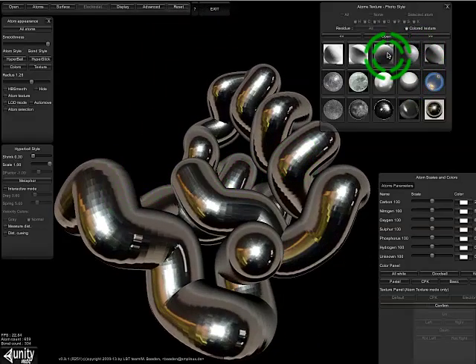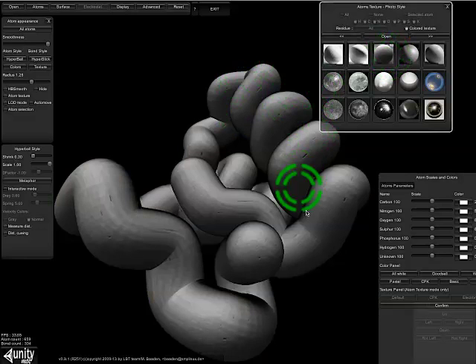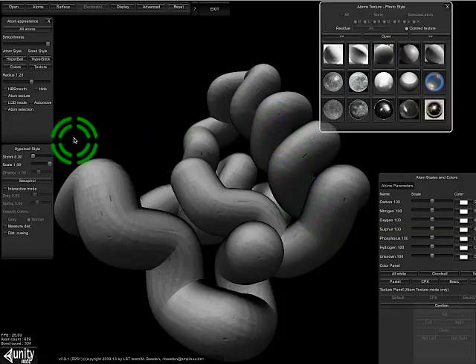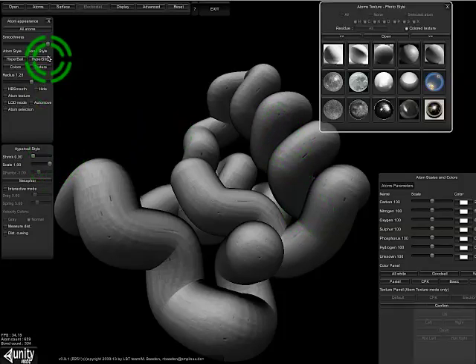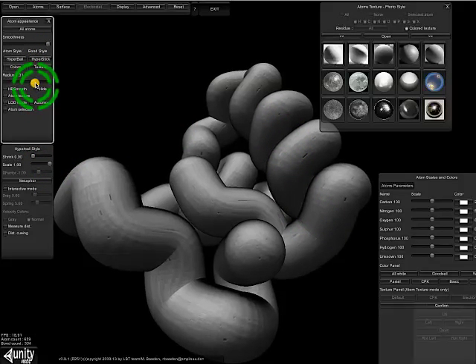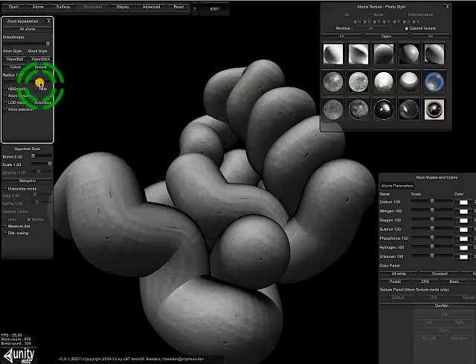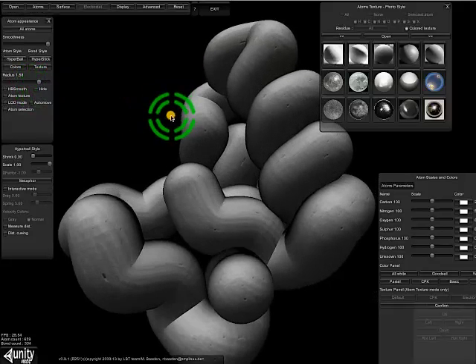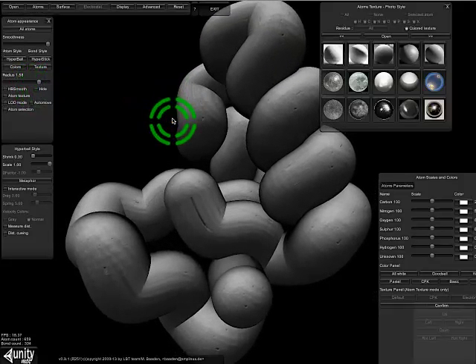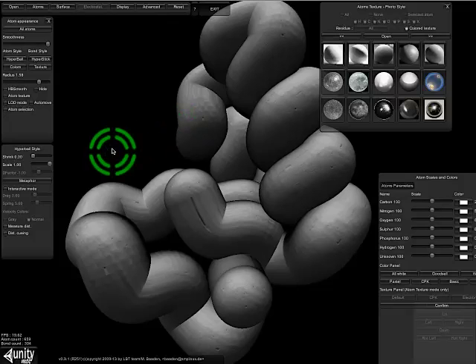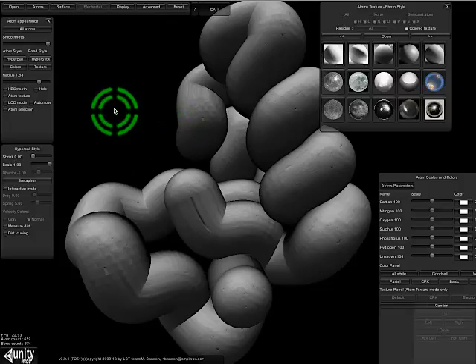Another one that renders nicely is this one. That gives some surface aspect to the surface of the tube that you can still increase. You can get some really artistic features out of the system. And that actually concludes our small roundup on the possibilities of advanced texturing in Unity.